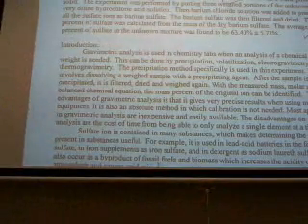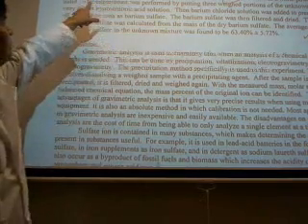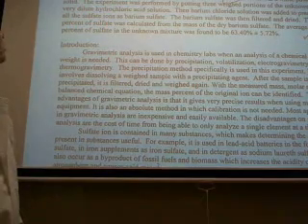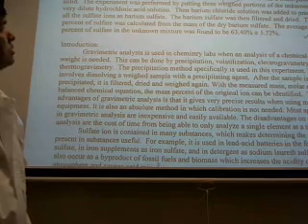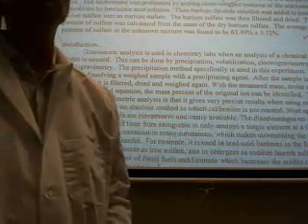Although none of these abstracts are perfect. For example, rather than calling it solidification, they should have called it coagulation. Little details like that detract from the abstract. The purpose of this lab experiment was to determine the mass percent of sulfate in an unknown mixture. The unknown mixture given to us was number 136, which was a white powdery solid. That's good. This is the first person to explain what the unknown even looked like.